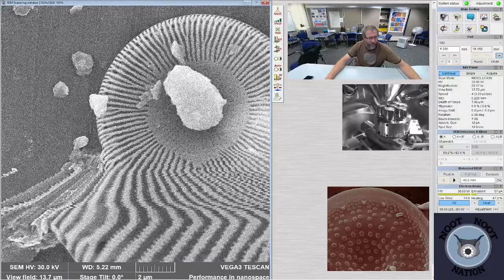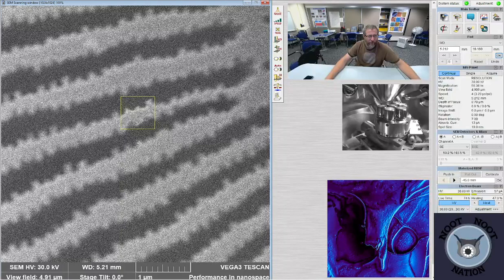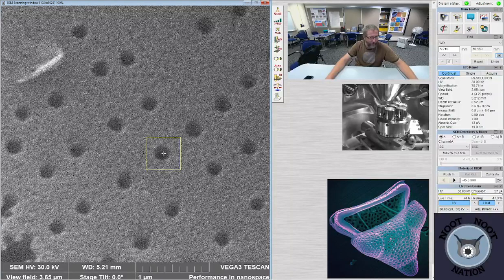So yeah, I can get to the point where I have an image pretty quickly, like within a couple of minutes, but then there's usually this sort of calibrating and monkeying around with getting the quality of the image better. And that probably usually takes me, I don't know, well, you're gonna sit through it, I guess, so maybe 5 minutes or so. It can take longer sometimes.